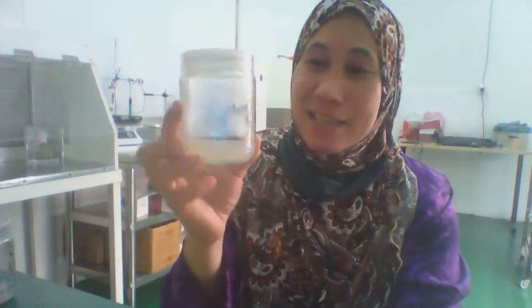But you have to use it all the way until rooting, until acclimatization, so that no fungus can grow along the way. Okay, so we'll see in another 2 weeks how it goes.